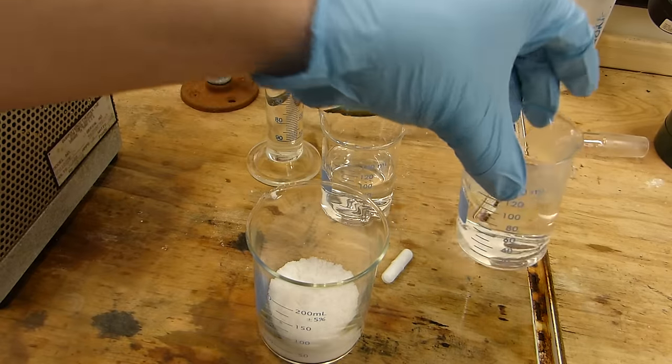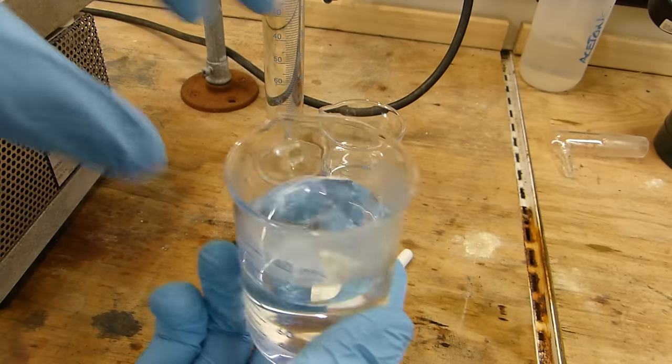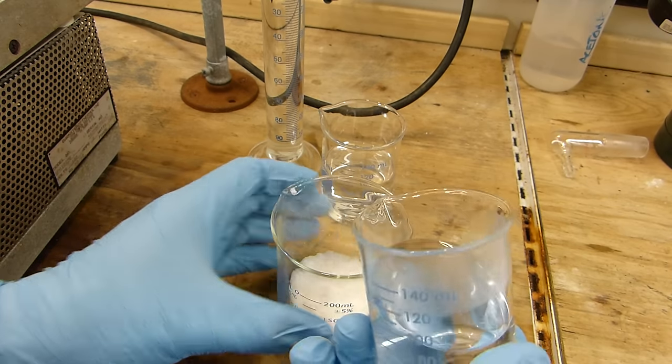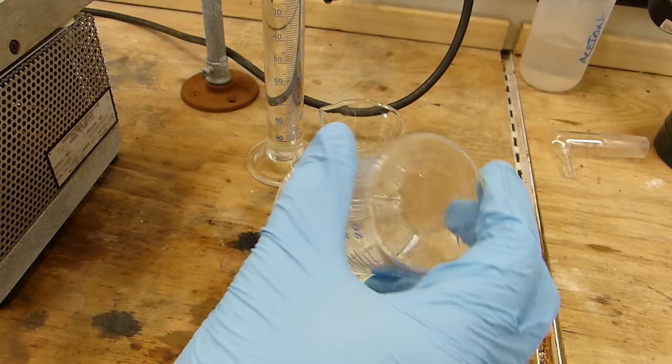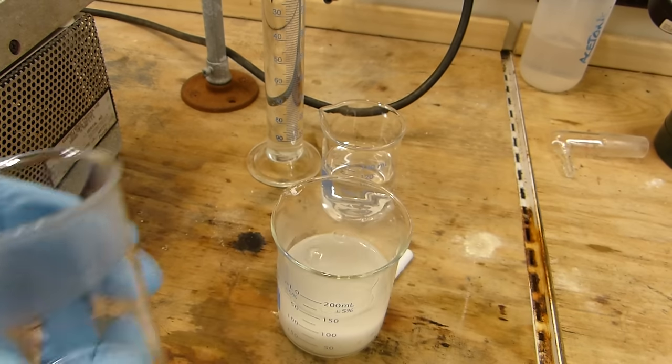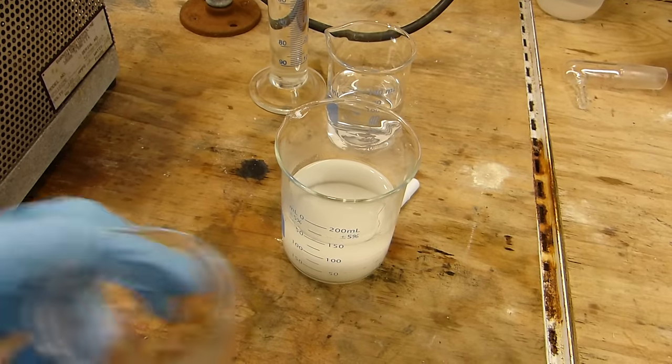Now the first thing I'm going to do is add this hot water to the oxalic acid dihydrate and start getting it in solution. So we'll just do that really fast and it'll take a little while to dissolve. I'll stir it periodically.